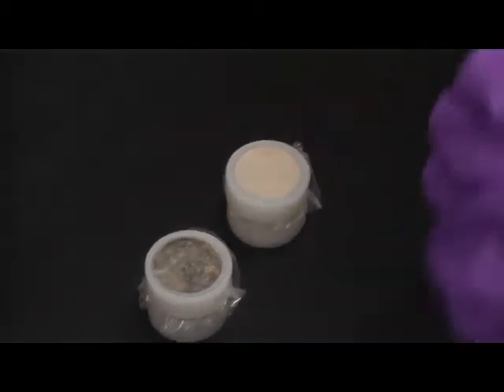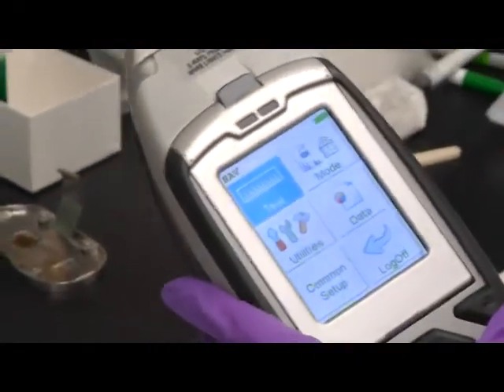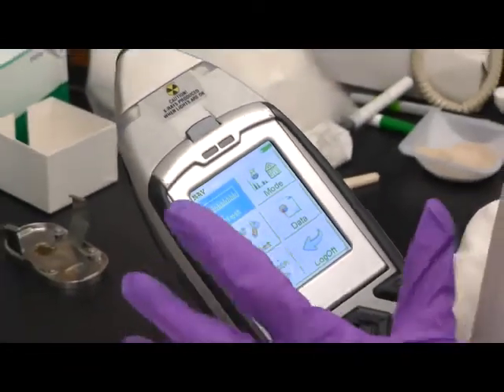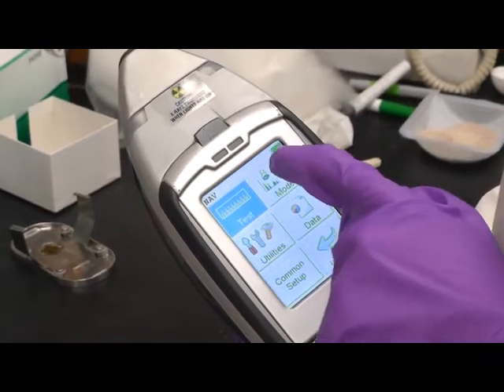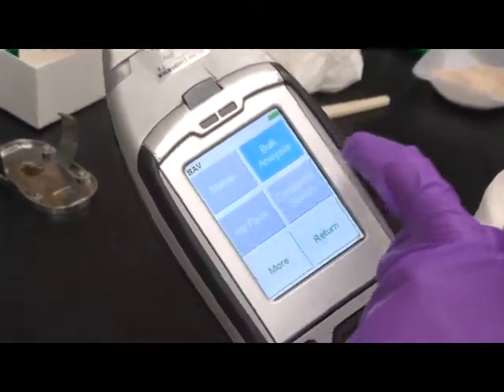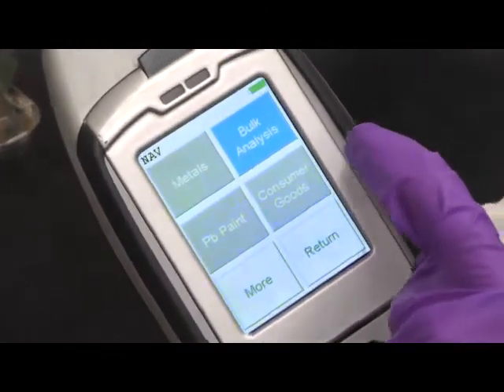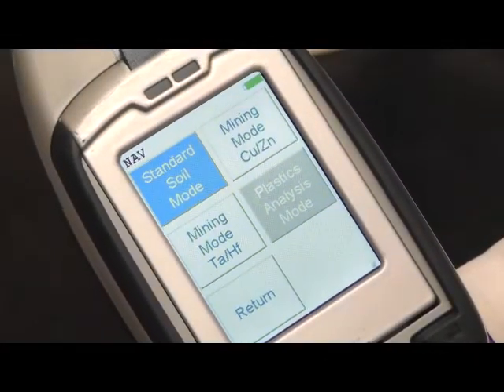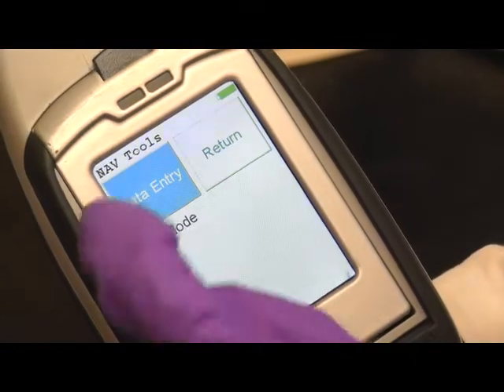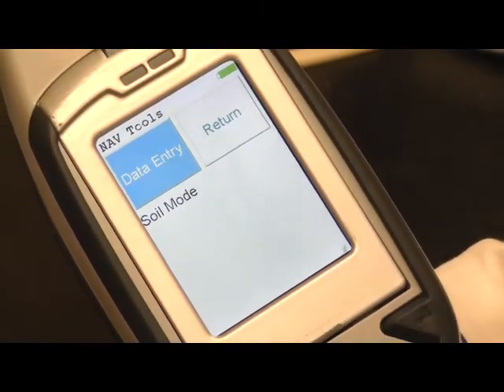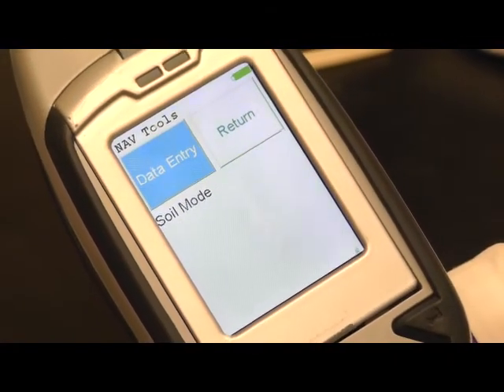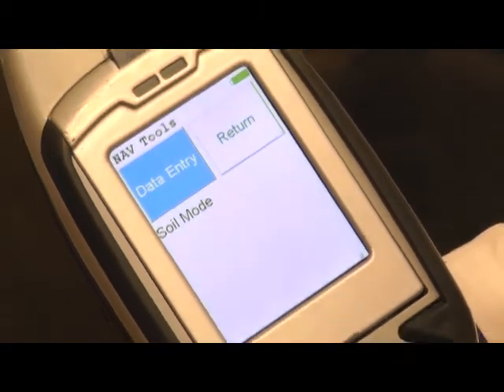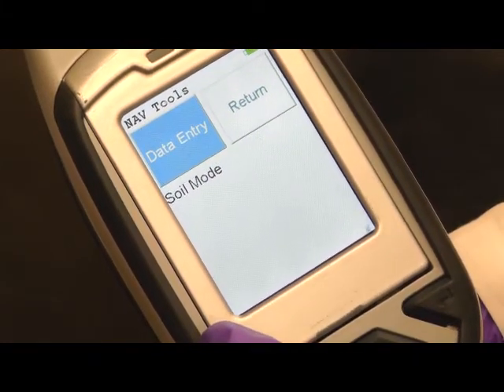And here's our XRF instrument. And after opening the instrument, we go to mode. And then we choose bulk analysis. And there is a mode called standard soil mode. And that's the mode we are going to use to measure soil and dust samples. And now we go directly to data entry.